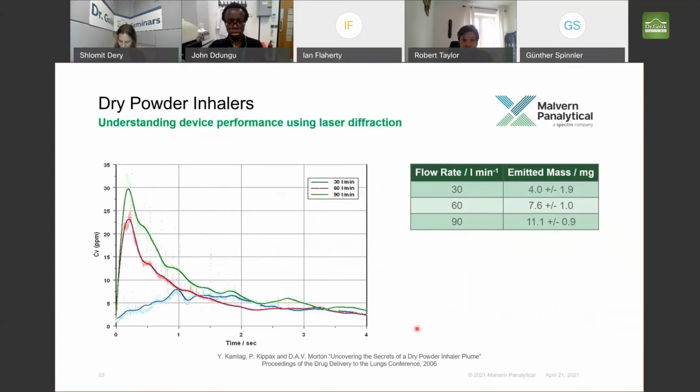Okay, and then finally, just on this topic, I mentioned at the beginning of the spray analysis technique, you also get the transmission data too, which gives you some information as to the actual content of the spray. And again, the lower the transmission of light, the higher the content of the spray.